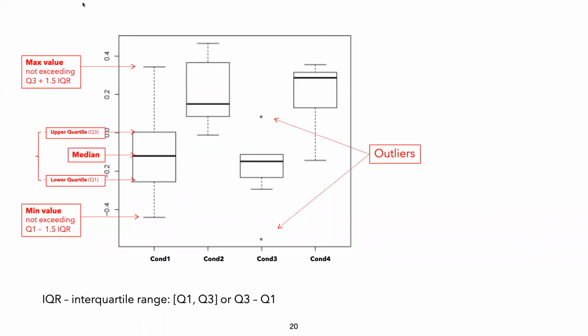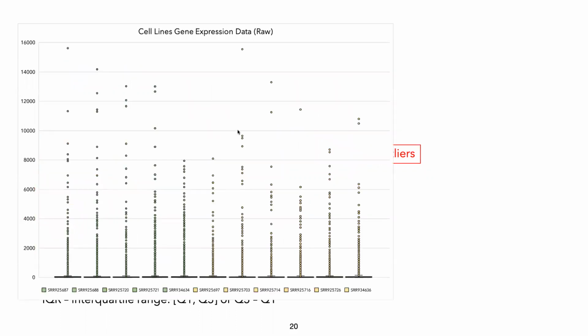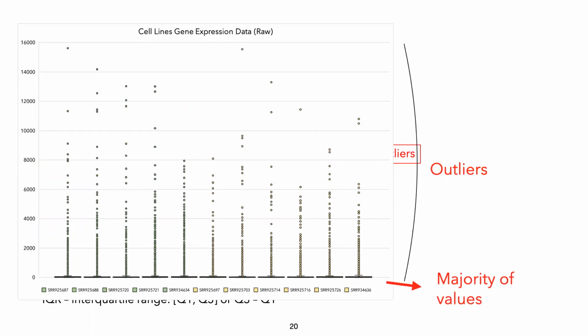So right here, this is a box plot, and in a box plot, you see these statistical properties for each one of your samples. This is the interquartile range, and what you want, for example, in differential gene expression or in a comparative analysis, is to compare your averages between groups of samples, right? So those averages have to be a reliable statistic for you to compare. So here we have our raw data that looks like this, and the majority of values are not seen very well, but the outliers would be seen.